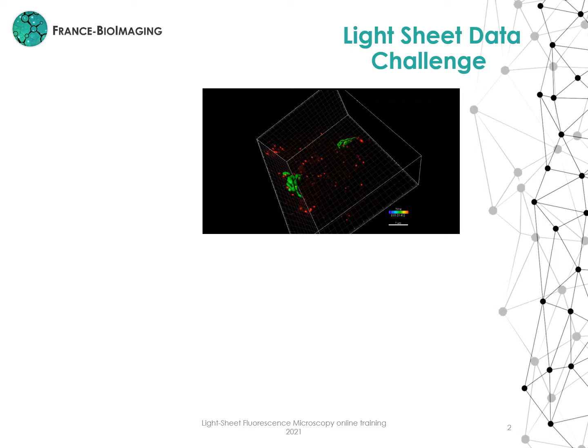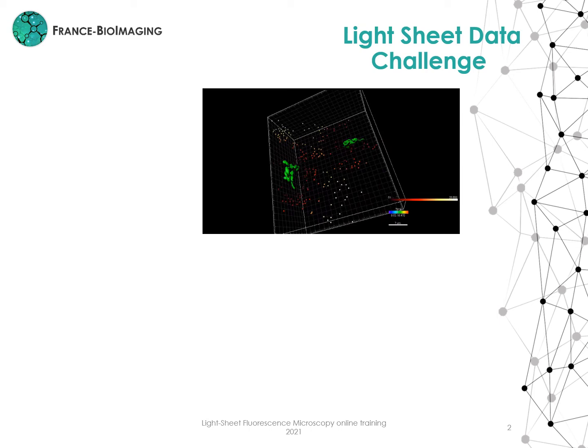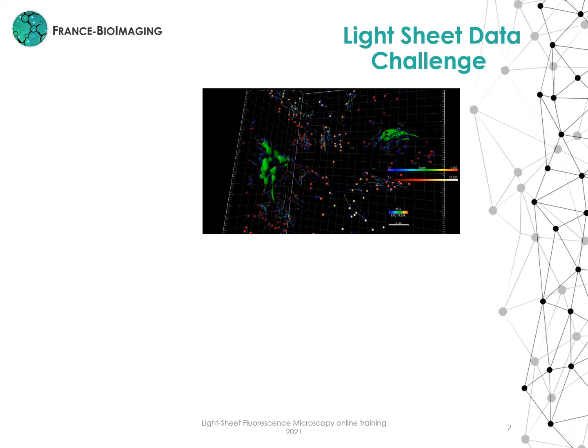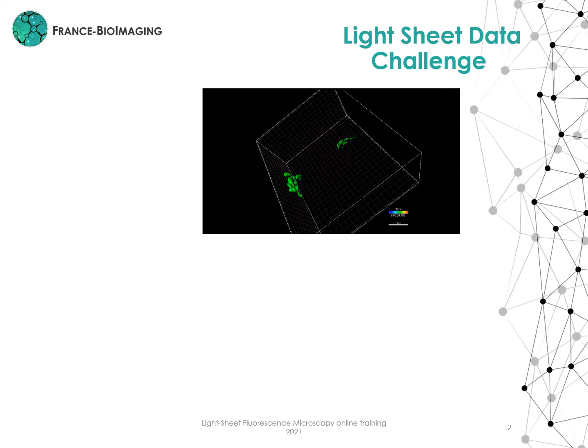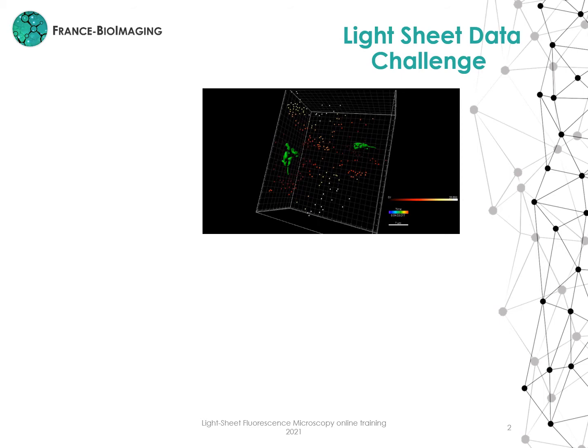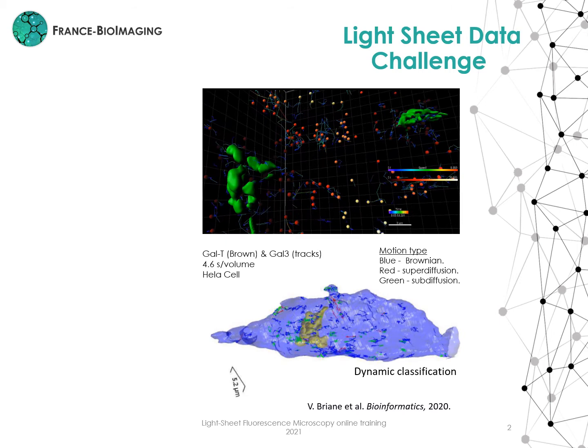I would like to show one simple experiment from the lattice light sheet microscope. Here I show the endocytosis of galectin-3, a lectin that enters into the cell by mainly clathrin-independent endocytosis. The workflow includes segmentation of the Golgi apparatus, spot detection, estimation of the distance to the Golgi and also to the cell membrane. Then there is 3D tracking and speed calculation. In fact, we could make even more complex analysis regarding the type of movement of these galectin-3 tracks.